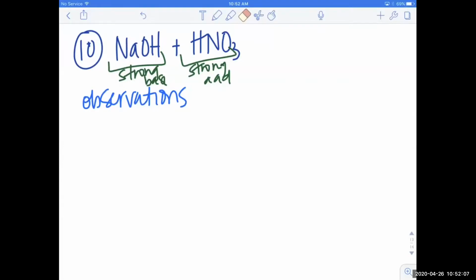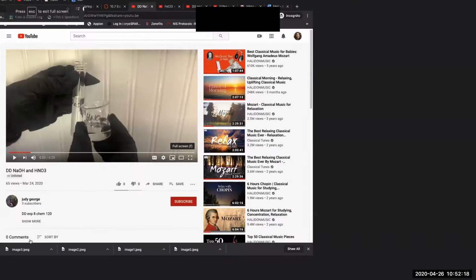And we're back. So we're going to do sodium hydroxide and nitric acid. So hopefully you recognize that this is going to be a neutralization reaction. So this will be a strong acid and strong base. So let's watch the video.